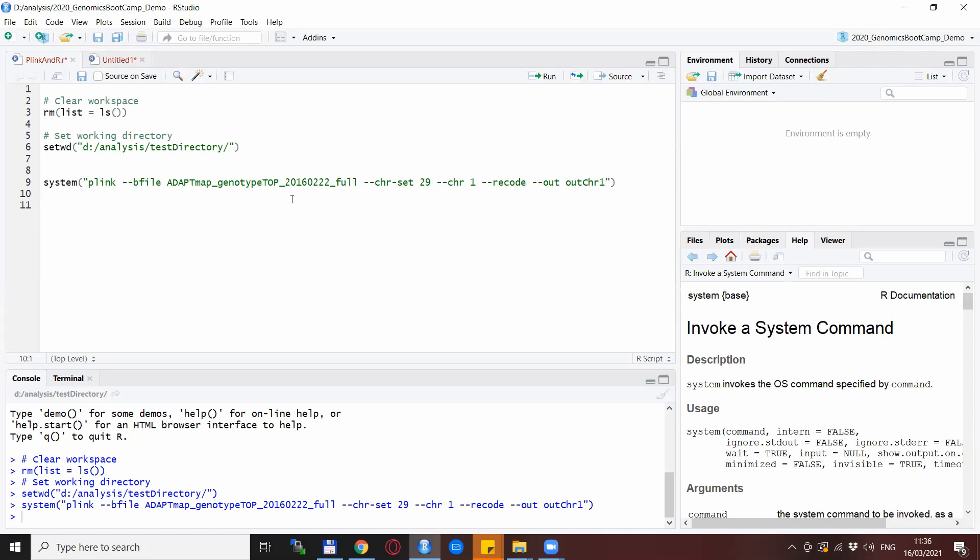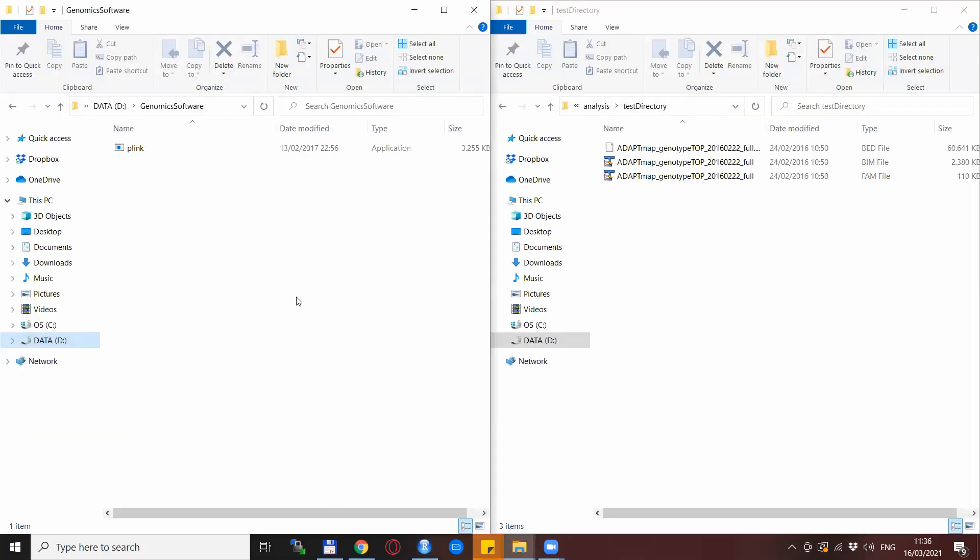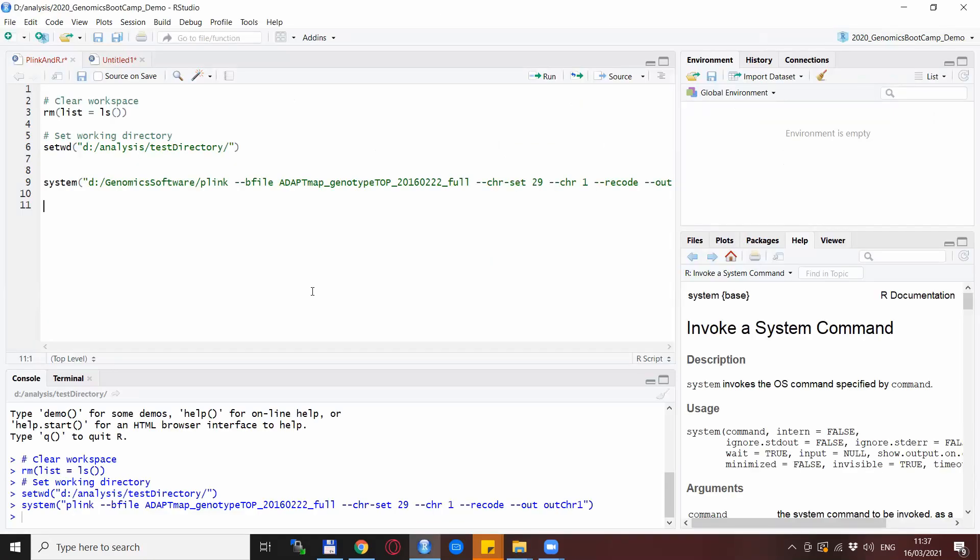That is because the Plink executable file is not in the same directory. Now what you can also do is link in the Plink with the full path. So I created a directory called Genomic Software and this has the executable file inside. So I can link in the full path to this Genomic Software directory and Plink to run Plink in a successful way. So now the Plink command is actually replaced with the full path.